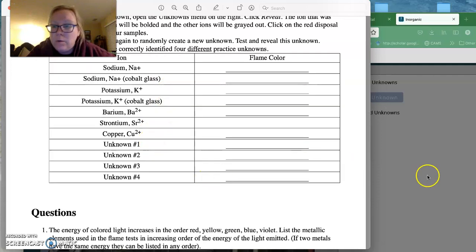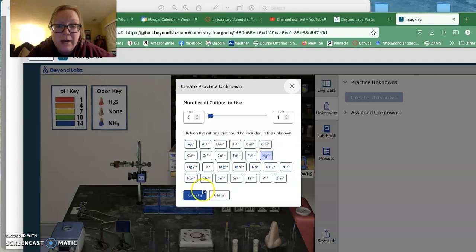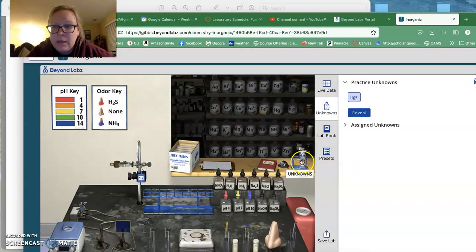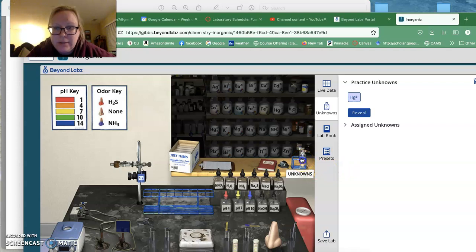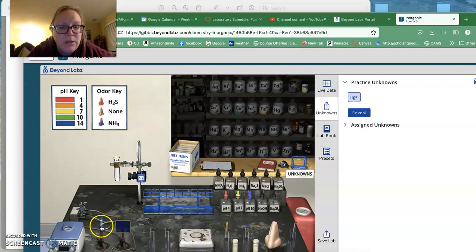And so if you're like, I really want to know what mercury looks like, choose that, create your unknown. There's your unknown that's been created, pull it here. It says UNK on it, and then use a flame test using that.